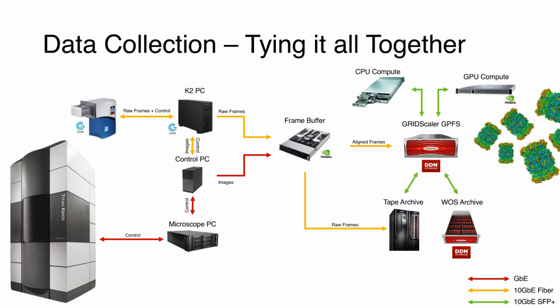It's hard to read and answer at the same time, so give me 1 second to see. Okay, is it possible or practical to use the K3 computer as the Leginon computer, or would you recommend using a separate PC?